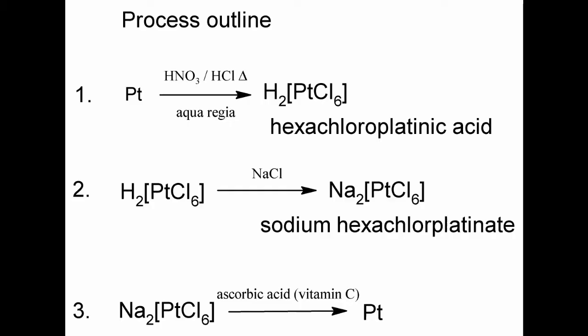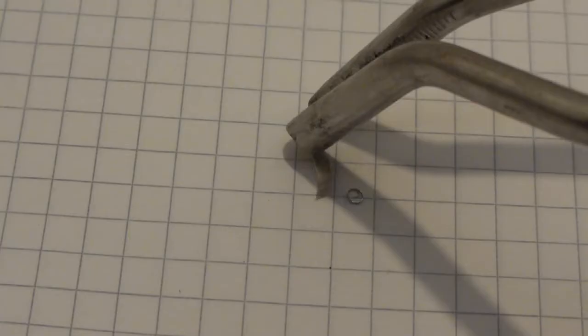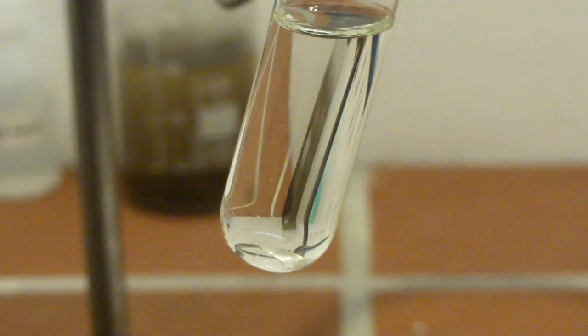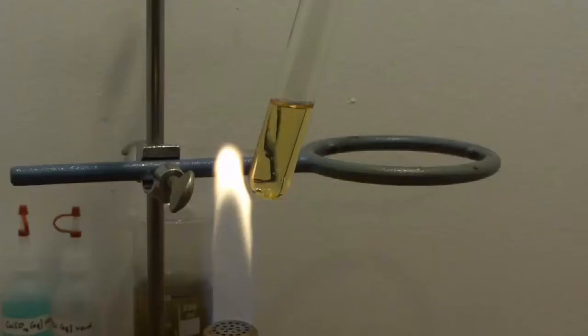Our goal now is to prepare sodium hexachloroplatinate. This will then be reduced to elemental platinum on the surface of the quartz wool. The first step is to dissolve the platinum in aqua regia. For this, add 1 part of concentrated nitric acid to 3 parts of concentrated hydrochloric acid. Add the platinum to the mixture and heat it up. The platinum should dissolve in a matter of minutes, forming a nice orange-colored solution.